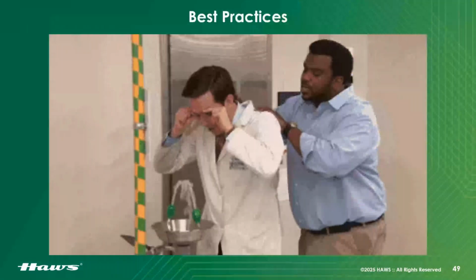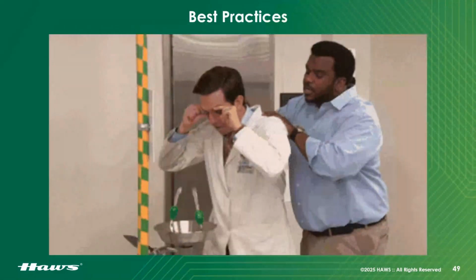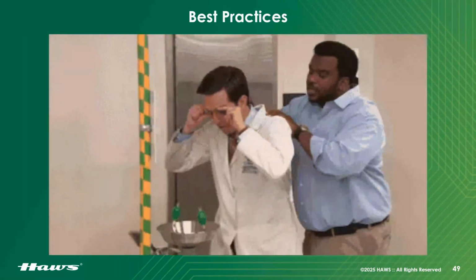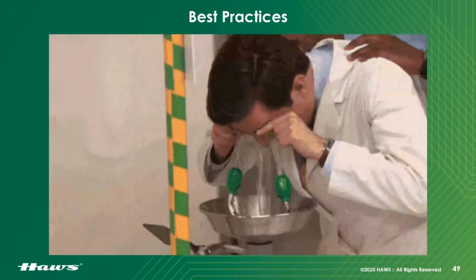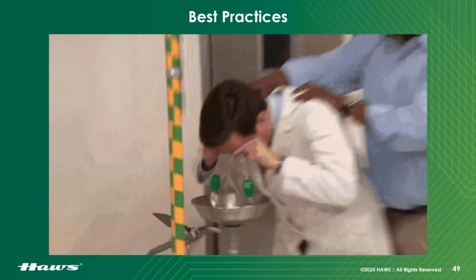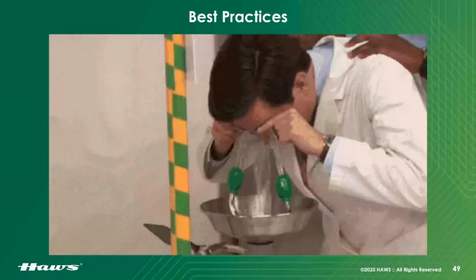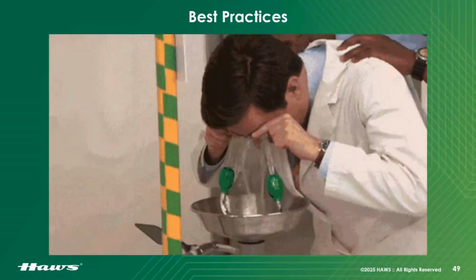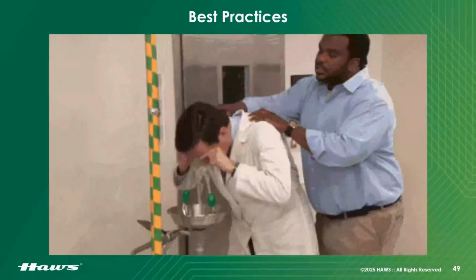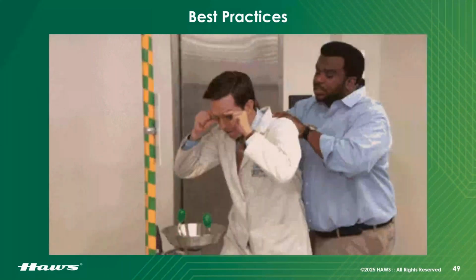Now, I like this because I think it's great technique. That's the Nard dog there in the video. But this is excellent technique. I want to drive this home. When I tell you use your fingers to lift your eyelids, I mean get in and peel your eyelids back and start rolling your eyes. Okay? You need to get in there. Okay? Not passively splash some water on your eyes. Make sure that you are really getting those eyelids back.